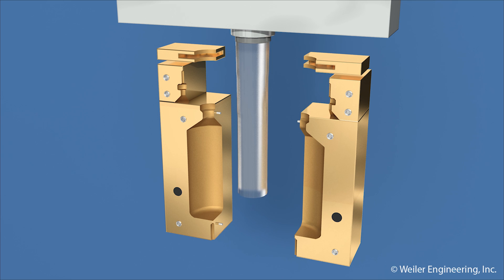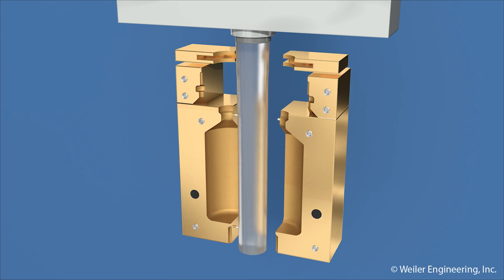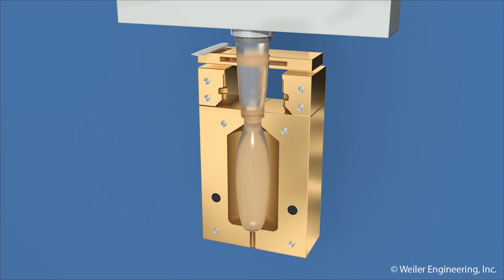Thermal plastic resin is extruded into a hollow tube known as a parasin. When the tube reaches the proper length, the holding jaw is closed and the parasin is cut.